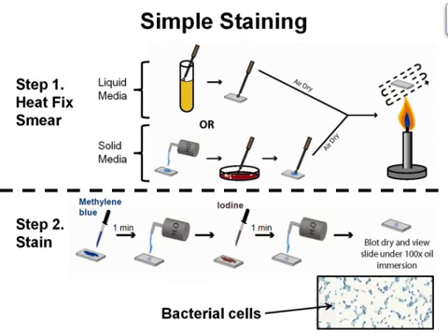Allow the dye to remain on the smear for approximately 1 minute. Note, staining time is not critical. Somewhere between 30 seconds and 2 minutes should give you an acceptable stain. The longer you leave the dye on in general, the darker the stain. Pick up the slide by one end and hold it at an angle over the staining tray. Using the distilled water wash bottle, gently wash off the excess methylene blue from the slide by directing a gentle stream of water over the surface of the slide. Wash off any stain that got on the bottom of the slide as well.